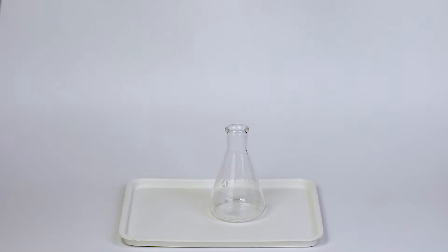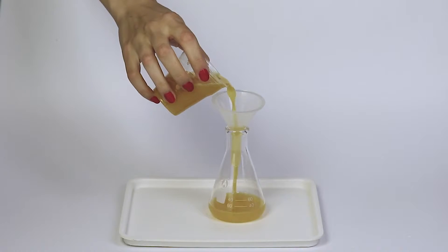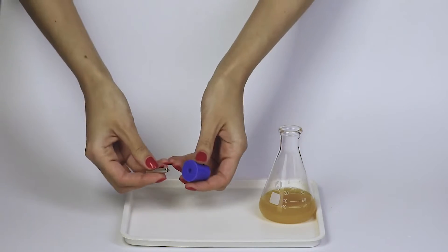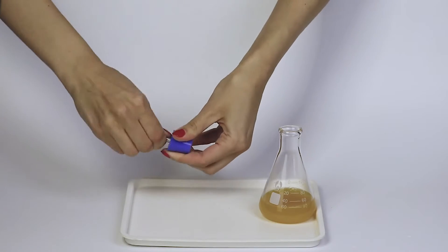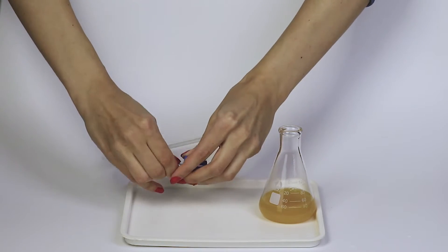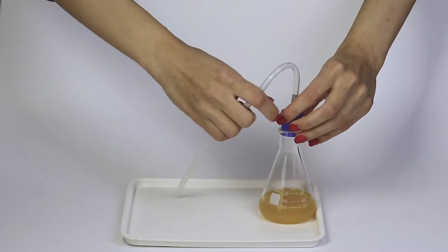Using the funnel, pour 40 milliliters of juice into the flask. Now insert approximately half a centimeter of the metallic cylinder into the rubber stopper, and put the silicon tube onto the other end of the cylinder. Carefully close the flask with the stopper.